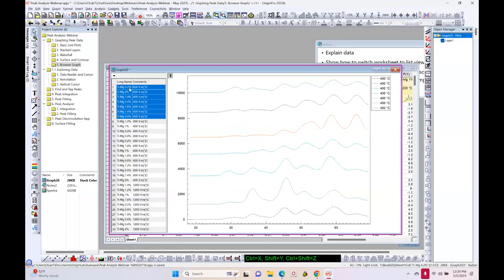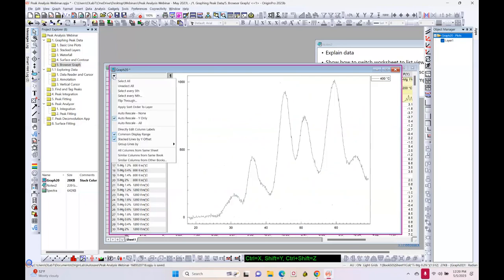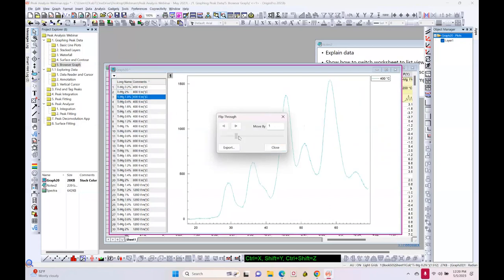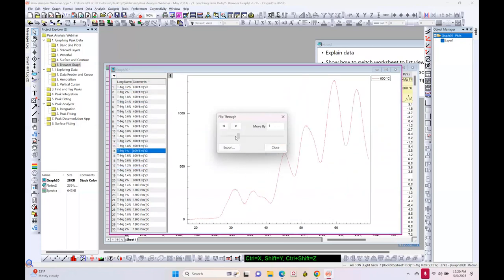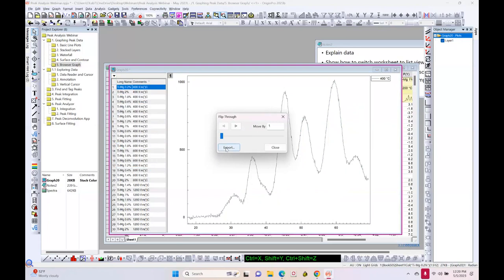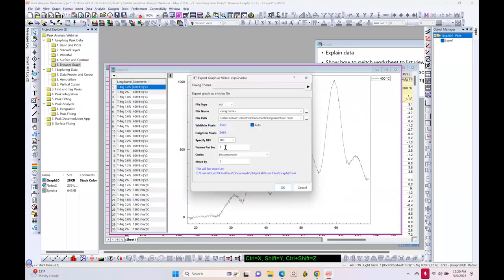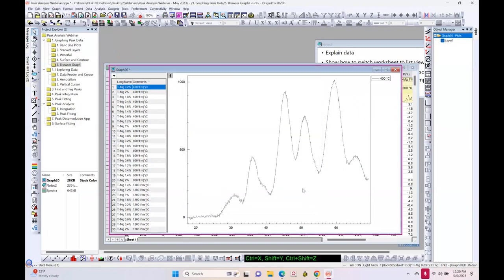Also, if you wish to make a video, there is a flip-through option. You can drag the slider to see how the data is evolving, and you can export it as an AVI movie. You might want to check out this browser plot — it's a fairly recent addition to Origin.